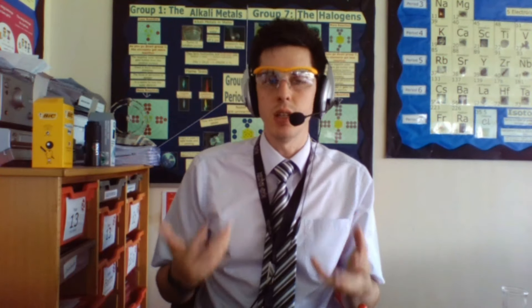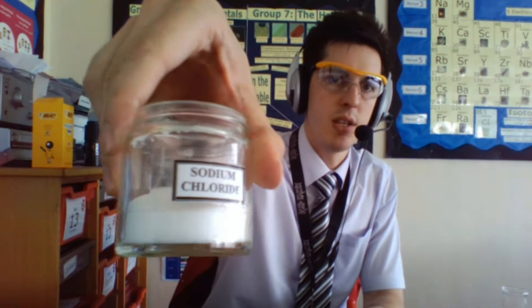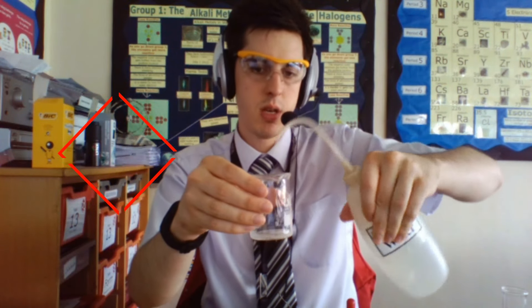So if you want to make an insoluble solid, the first thing you need to do is have your two soluble solids. In this case I'm going to be using sodium chloride and lead nitrate. Now the lead nitrate is already dissolved but the sodium chloride is not. So your very first step is to get a spatula of your sodium chloride, dissolve it with a little bit of water and then stir it until it's fully dissolved.